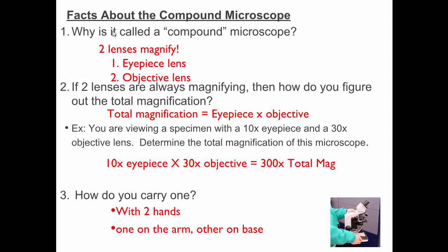Sometimes you use it just to get a really good three-dimensional picture. Like when we looked at all those insects, those weren't magnified a great deal, but they were giving you a really nice three-dimensional view of the exterior. But you can use electron microscopes to see cell organelles inside of a cell that you can't see in a light microscope. Smaller things than even a cell, bacteria, for example, or things like that.